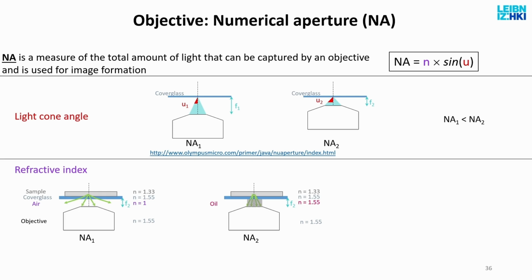So a lot of light which hits the edge of the oil droplet at or above the critical angle will reflect. So the oil droplet works like an optical fiber. It leads the light into the lens. If I don't put oil there, the lens will work, but the numerical aperture will be much smaller because I lose all this light.